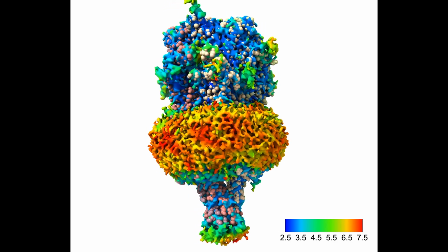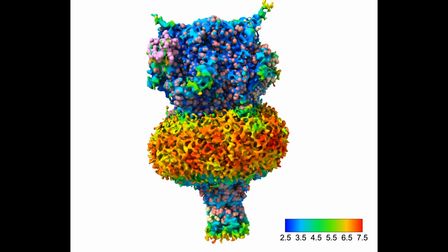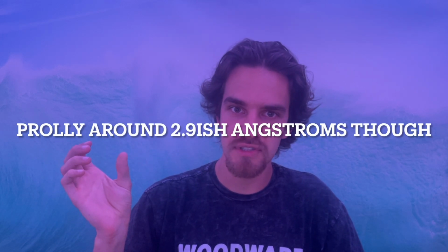So looking now at the actual local resolution, I can't access the program I used to create these maps right now, just with the case I'm in right now. So I don't actually know the resolution of this image, but we can see the local resolution here.